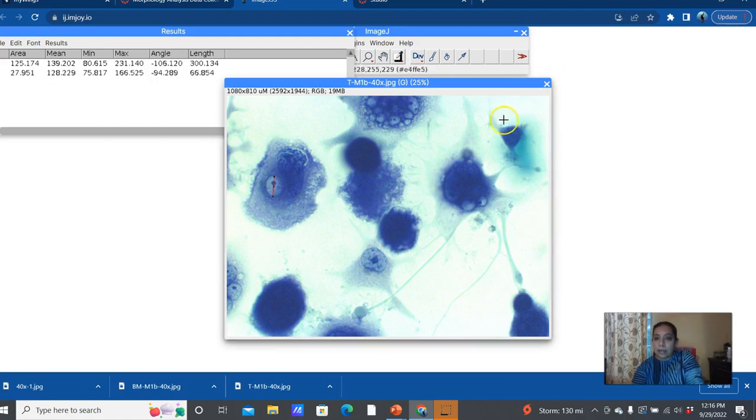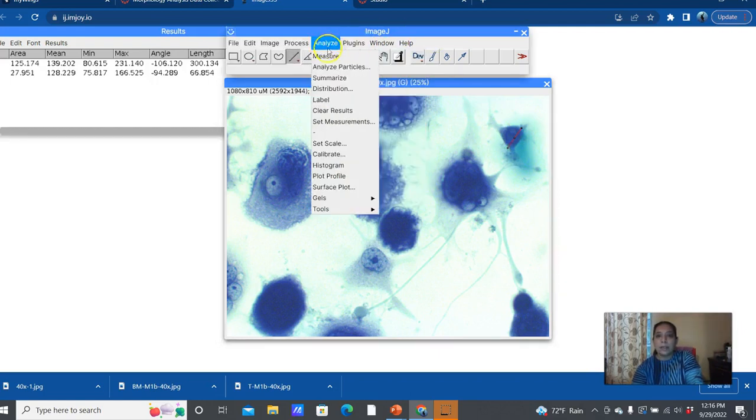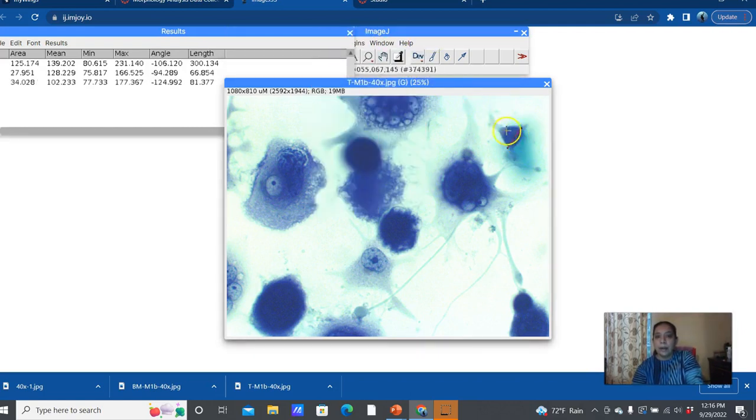Here is a small cell, right? And for cells with projections, you're only going to worry about the actual cytoplasmic cell body portion of it and not worry about the projection. So for this one, I guess this side maybe would be the longest, and I will say measure, and then I will go back and I will look at the nuclear size. Oh, that seems a little long.